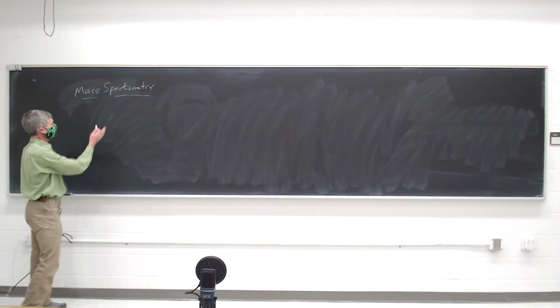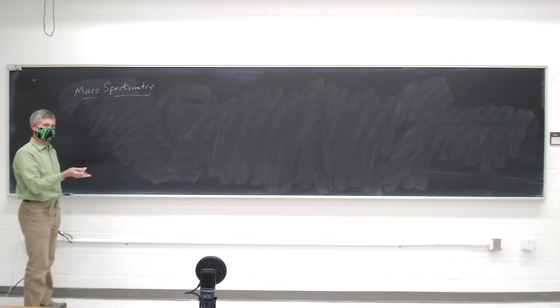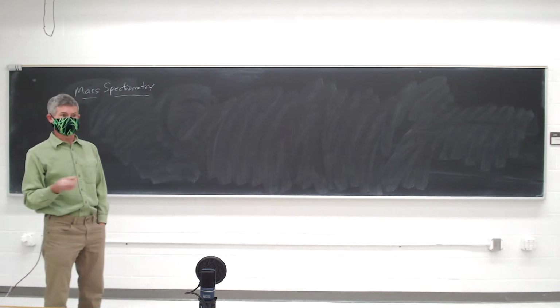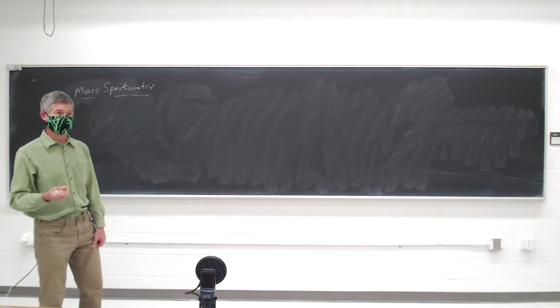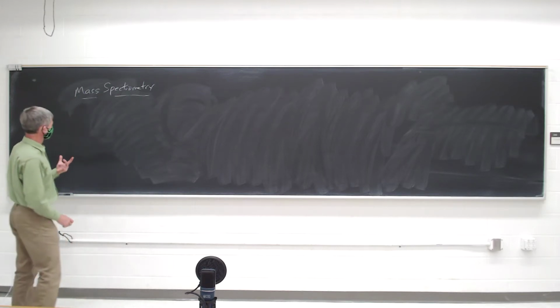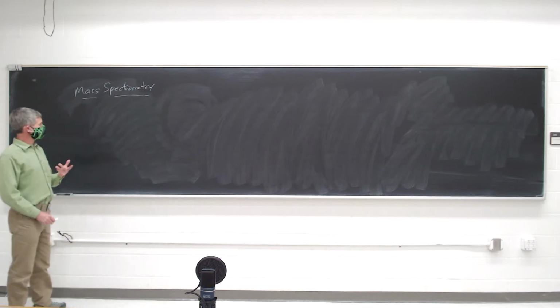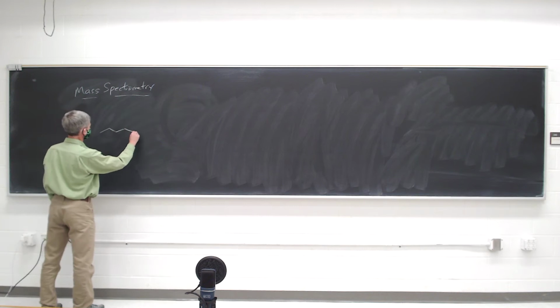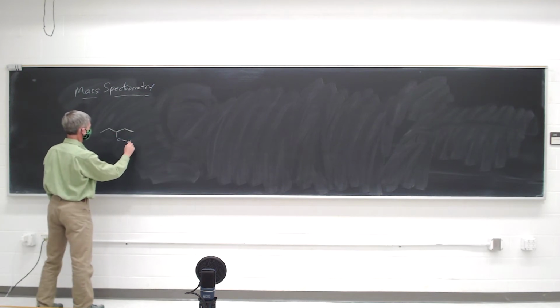So the question is, what is mass spectrometry, right? How does it work? What happens? The instrument we have is a little bit different from the one I'll be describing today. It's cheaper, and it uses a different type of mass selective detector, but the principle is kind of the same. And I'm going to use as my initial example just a simple alcohol. I'll just use 3-pentanol.